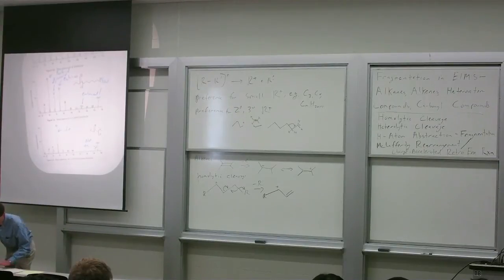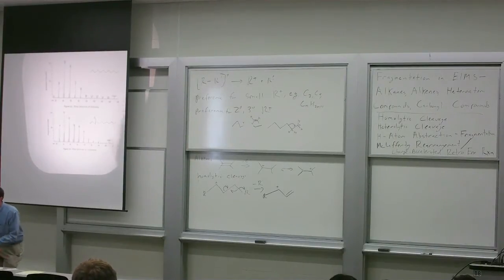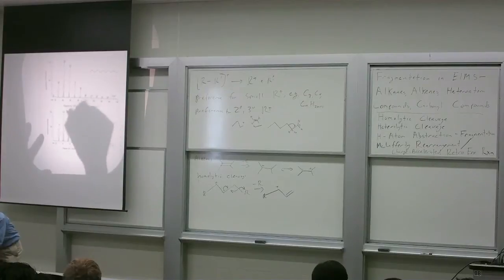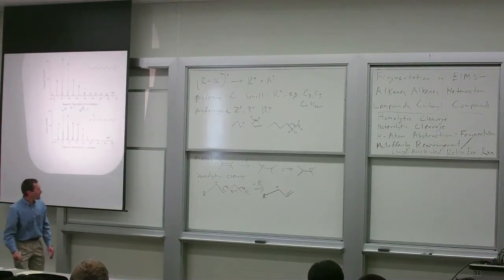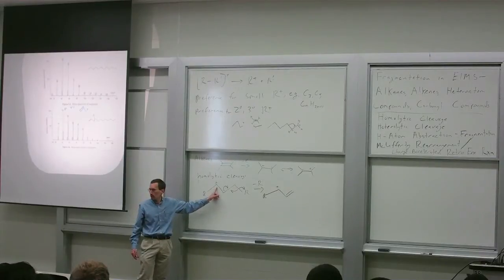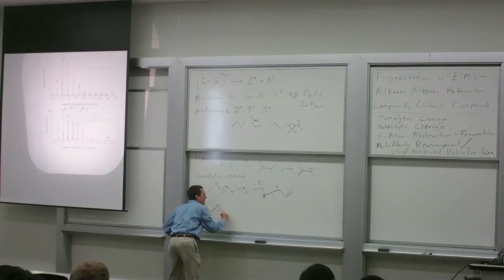And so let me put up the spectrum of dodecene in comparison to dodecane. And so in the spectrum of 1-dodecene, we see the base peak. Base peak means the biggest peak at 41. So two less than the propyl, 41 just corresponds to the allyl carbocation. And as I said, the reason that's not the only peak that we see is because the alkene walks all over the molecule. I'm not going to push arrows right now, but you can imagine, I will just start you on the process. If you want, you can expand upon it on your own.